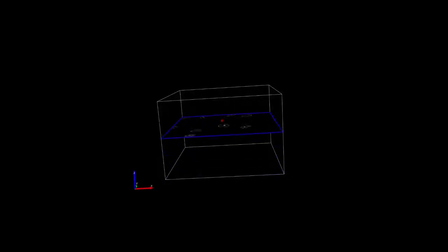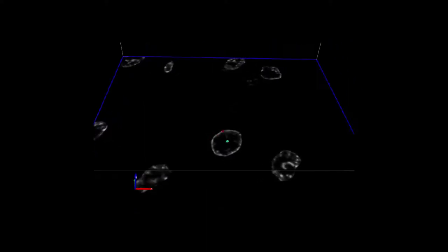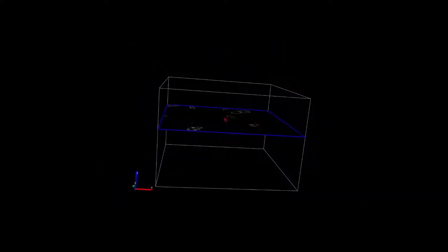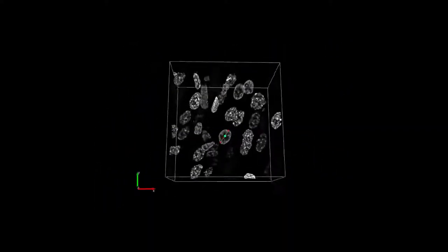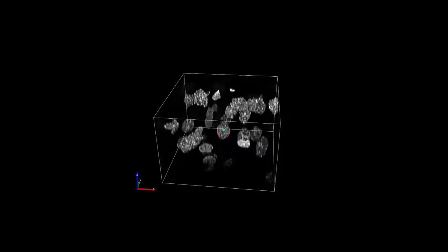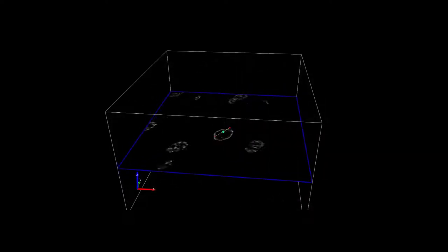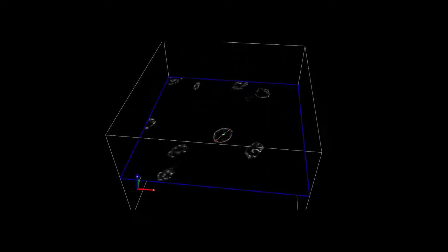Next up is the Nucleator. The Nucleator probe is used to estimate the mean cross-sectional area and volume of cells. The Nucleator probe builds off the optical fractionator. Here, instead of marking the top of the cell, we will mark the middle of the cell.